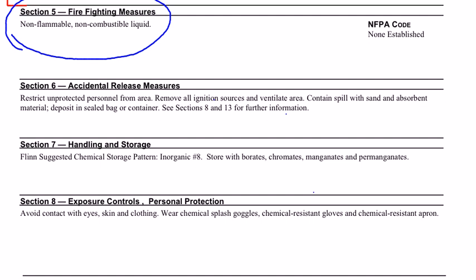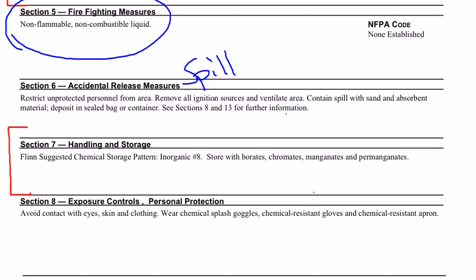Section 6 tells you what to do if there is an accidental release — another way of saying if this solution is spilled. Section 7 is more for your instructor's and student helper's use. It tells you where to store the compound and what to store it with, because in chemistry, things react if they are in close contact with each other.